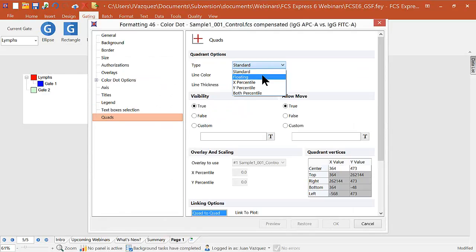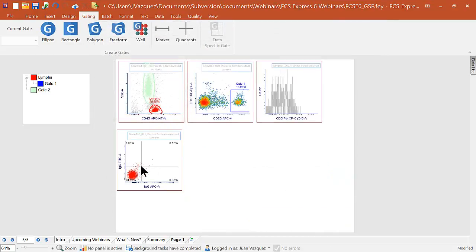So maybe I want something called a floating quad, where if I select that, I can actually adjust the 5 endpoints that are available as part of that quad independently of one another. So if maybe I want to put the center point out there, maybe I want to put each one of these endpoints over here, or maybe I just want to join them together as much as I can. I can adjust each one of those vertices independently of one another, and I can put them wherever I need to better fit the data within that plot.